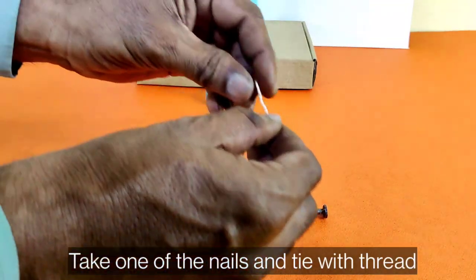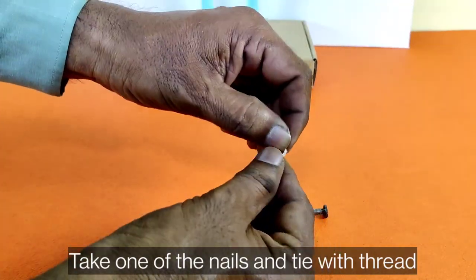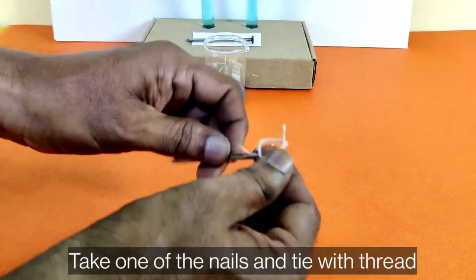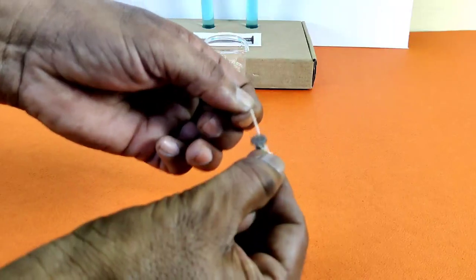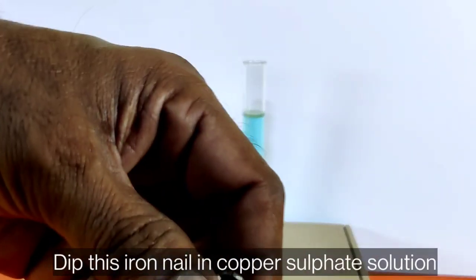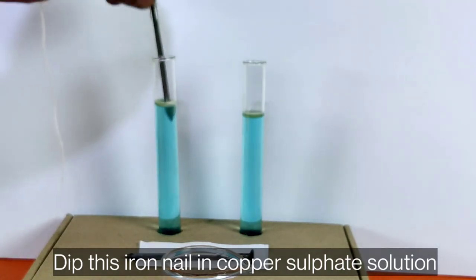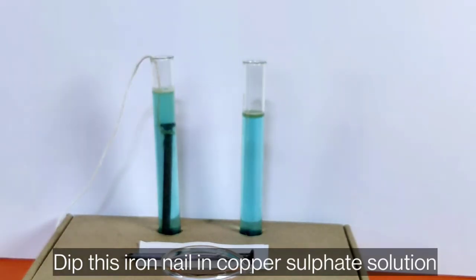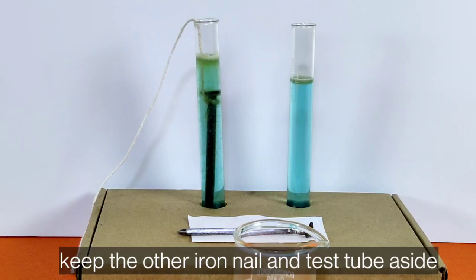Take one of the nails and tie it with thread. Dip this iron nail into the copper sulfate solution. Keep the other iron nail and its test tube aside as a control.